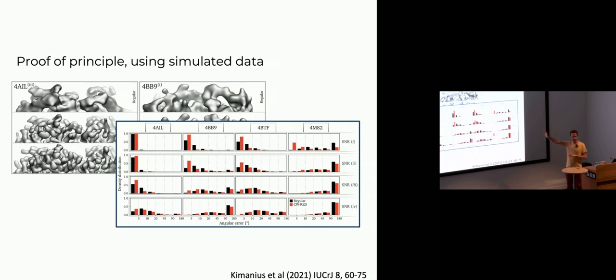One problem with these types of approaches is that you're now injecting knowledge that we typically use to validate into the process. And problems like hallucination become a real problem. By definition, what comes out of these refinements will look like a protein, because that's what the denoiser does. It turns something noisy into something that looks like a protein. And already in Dari's proof-of-principle paper, we describe some of the problems here. The implication is you cannot really trust anymore what comes out.